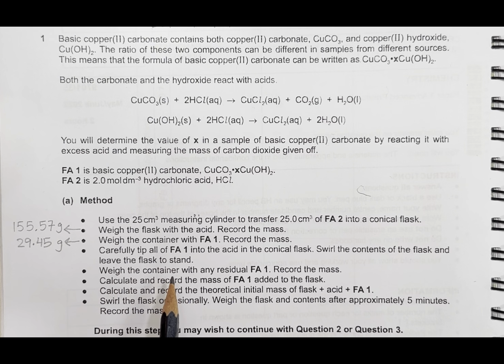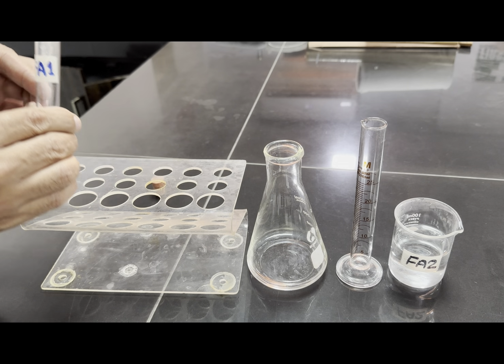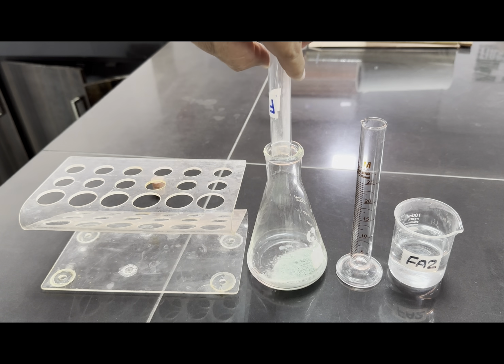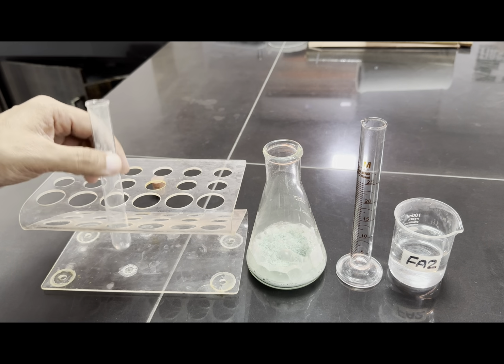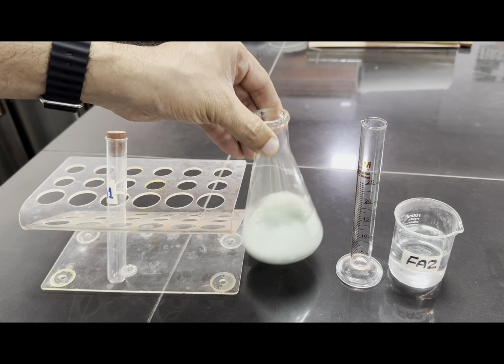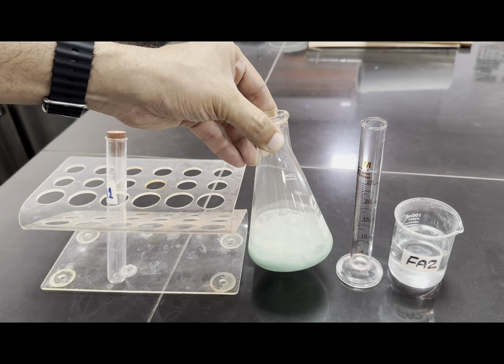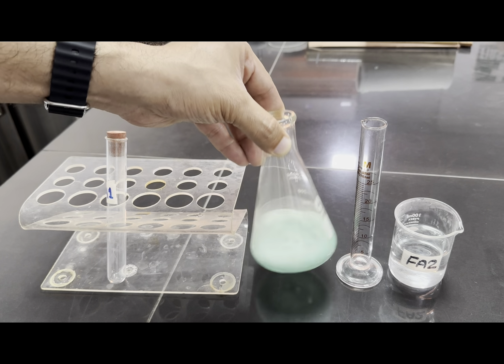Meanwhile, weigh the container with any residual Fa1 and record the mass. So let's do it now. Tip all the Fa1 into this conical flask, and shake the flask for the reaction to happen. As we can see, fizzing is happening. A lot of gas is released, meaning carbon dioxide is forming.